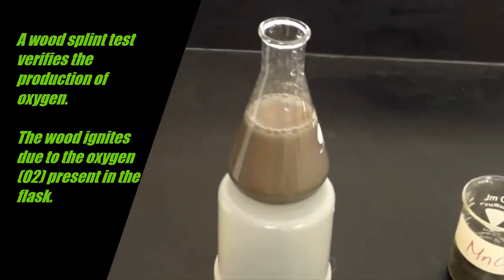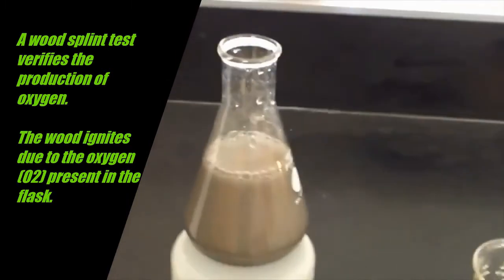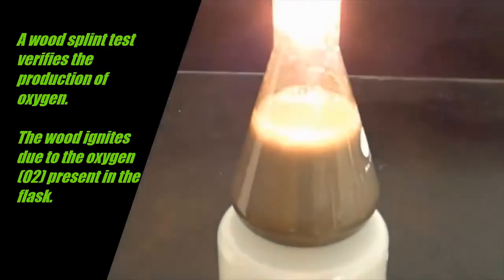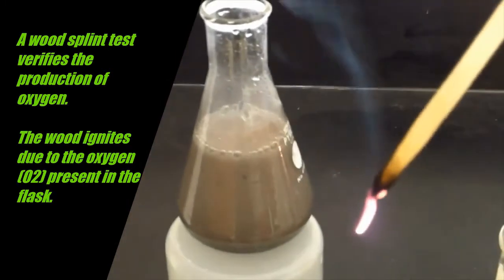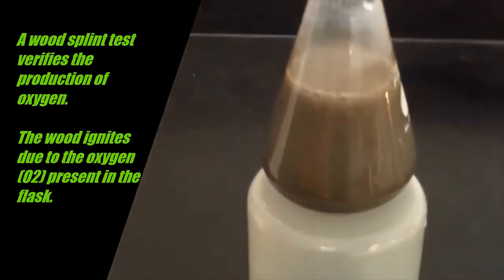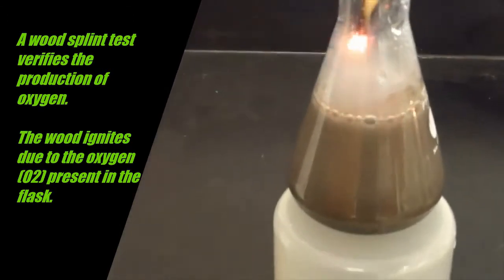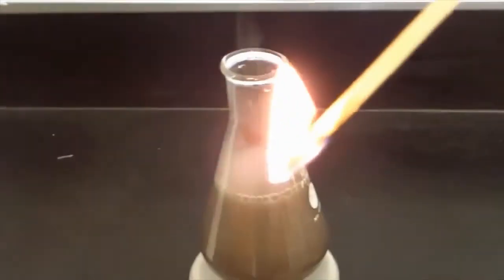Oxygen. A wood splint test can be done to prove that oxygen gas is being made by the reaction. Once the reaction is going, there is a high concentration of oxygen in the upper part of the flask. This causes the piece of wood with the glowing ember to reignite and start burning again. The driving force of this reaction is the addition of the MnO2, which is the catalyst.